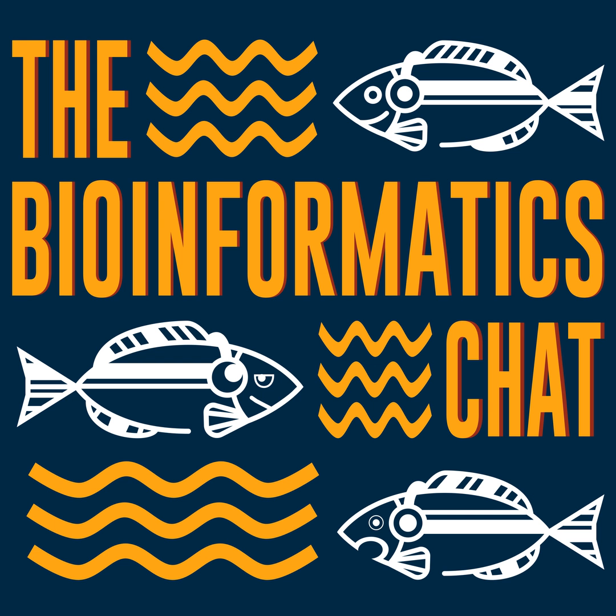But it's very simple. The goal is to read the sequence of a genome, and it could be a small genome. People historically started to work with small viruses and phage, and then they started to analyze more complex genomes such as bacteria, and then they moved to eukaryotes, to Drosophila, and then finally to humans. And the technology does not allow you to sequence the entire chromosome sequence or genome sequence. Instead, you can only sample short substrings of this sequence called reads. But you can sample as many reads as you want generally. And so what this results in is a huge set of these short overlapping sequences, reads. And then your computational problem is, given these short sequences, you need to assemble them back into the original chromosome, original string.